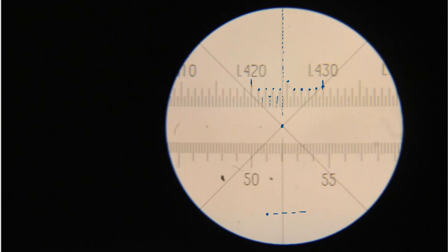So for instance, let's say that my readout was right here, smack dab on that line. What would be my readout for this value? Well, this is going to be 1.42 something, right? Because I don't get to 1.43 until here. So this is 1.42 something. Well, that's 1.421, 1.422, and this is 1.4225. And then 1.423, 1.4235, 1.424, 1.4245, 1.425. So you should always report 4 decimal places for your refractive index.